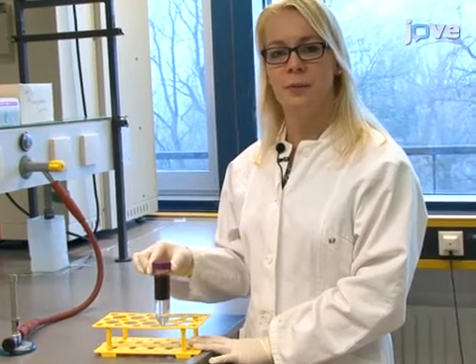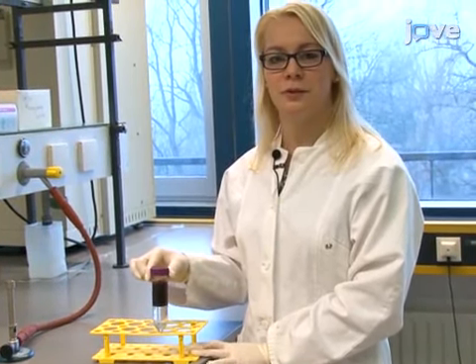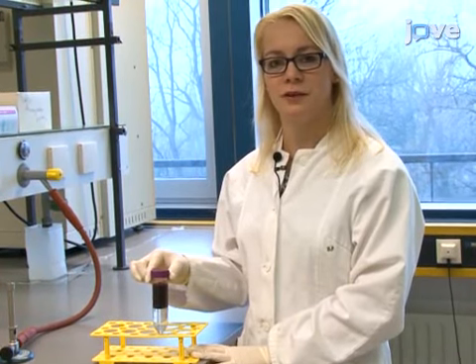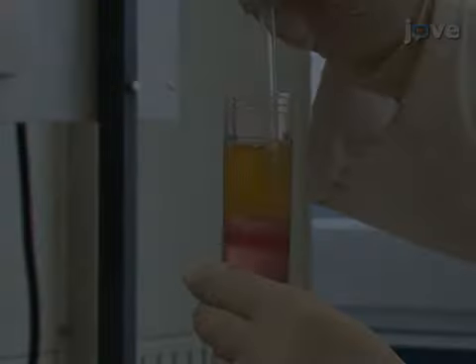After the centrifugation step, plasma and mononuclear cells need to be carefully removed to avoid contamination or unspecific activation of cells. Remove the mononuclear cells and the yellowish plasma.